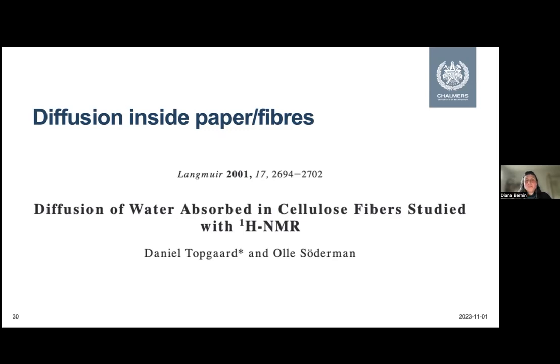So if you want to find how to do it in a good way, then you should look at this paper, because everything is explained in detail, and it's a really good one. But it's quite tedious too, because you have to record a lot of different sequences and then basically subtract the interactions of the water with the cellulose from the diffusion.